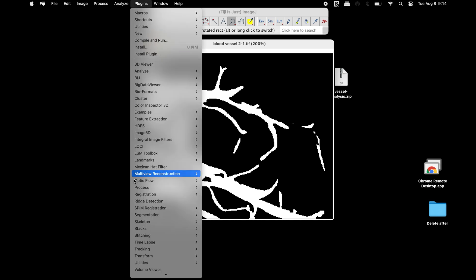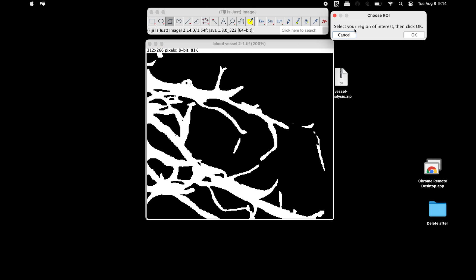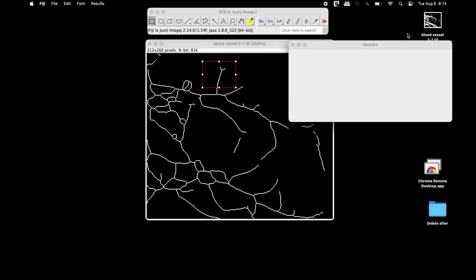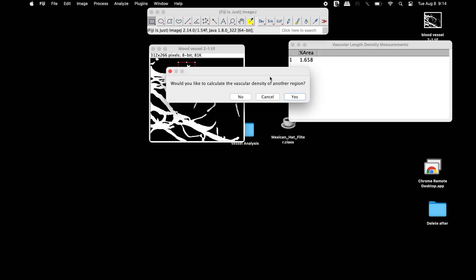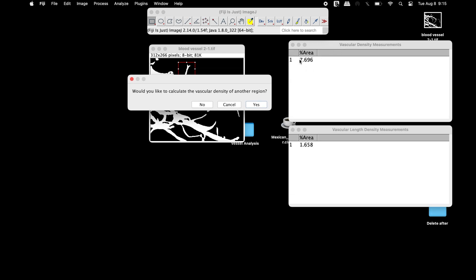Click on Plugins and scroll down to find vascular density. The Choose ROI window asks the user to select a region of interest and then click OK. Either use the polygon selection tool or the rectangular selection tool and mark the region of interest. Once completed, click OK. Two results are displayed: the vascular density measurements, which measure the ratio of vascular area to total selection area.